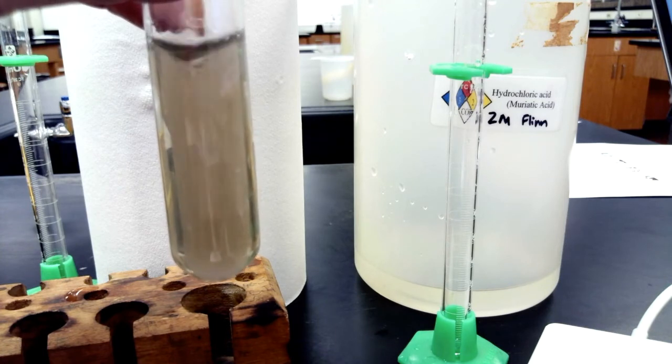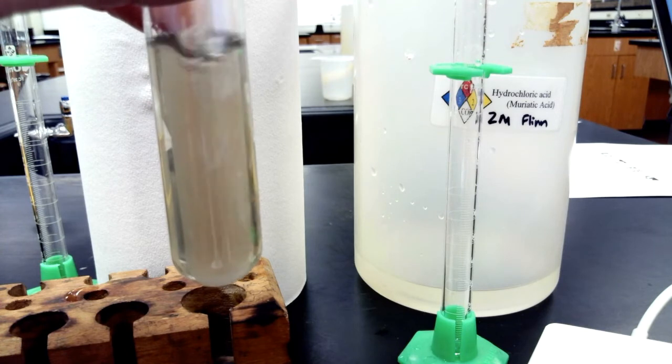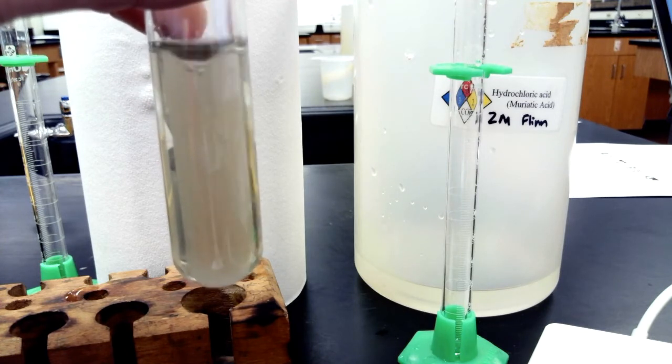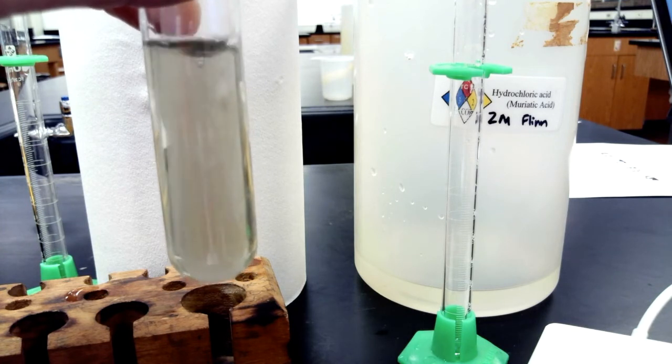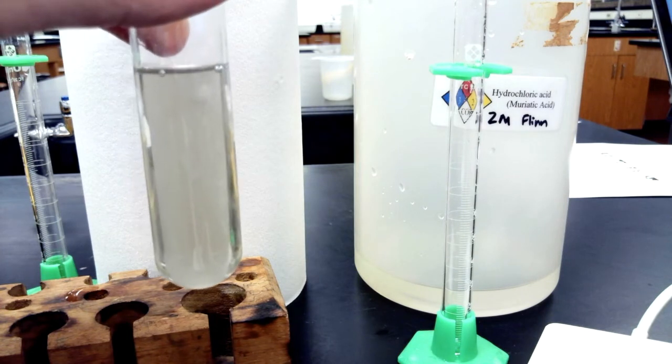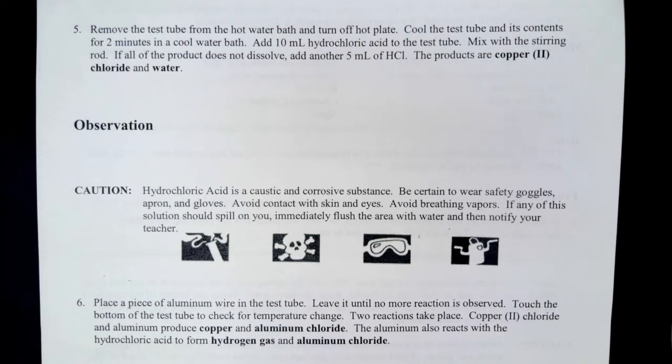For your step 5 observation, you're not actually going to have a precipitate observation. You'll just have a liquid observation, so you'll only record the color of the liquid. It's kind of hard to tell; I tried to have a white background. It's a very light blue color. So the liquid is a very light blue color, and there is no precipitate. This is step 5 here. Take a second to record your observations.